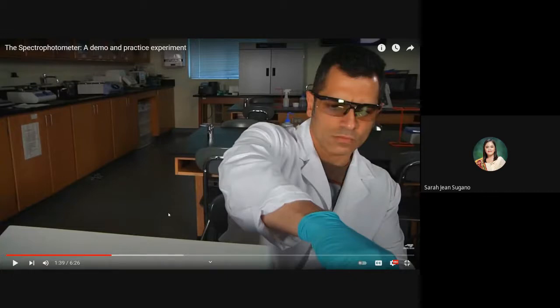Based on my experience, class, it's no longer a knob that you turn. There's just a button you press that equals zero, which is very convenient. So with the latest models of spectrophotometer, and there are also different brands, and different cuvettes, multi-container cuvettes where you can put many samples at once.